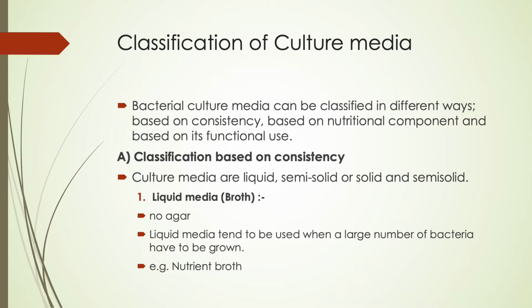Actually, the classification of culture media: why do we need to classify the culture media? I want to ask you one question. Why and for what purpose do you need to use the experiments? For example, you have a bacteria. What do you want from that bacteria? This is the first thing. And the second thing, you have to ask yourself about your sample. What do you want from that bacteria?